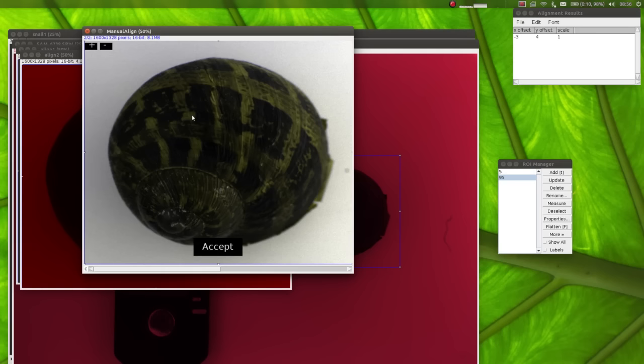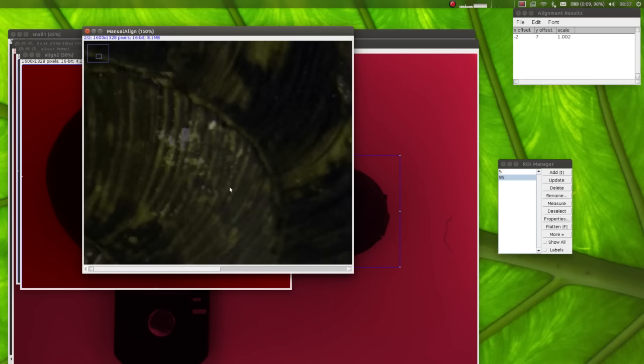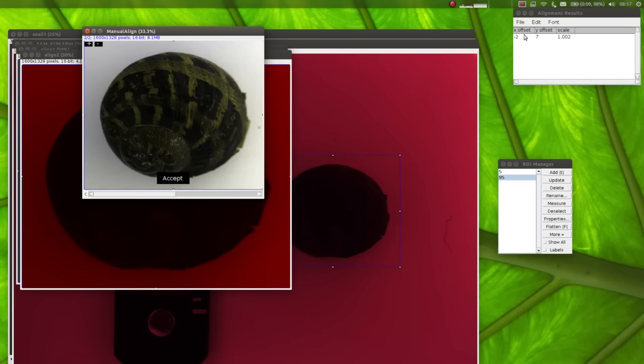Some lenses also will have a bit of chromatic distortion between the visible and UV, and that will cause one of the images to be slightly bigger than the other. In order to control for that, you can use the plus and minus buttons here. So for example, if I press minus a few times, it makes the yellow channel here smaller than the blue channel. This value looks okay. The values of your offset are shown at the top right here. When you're happy with the alignment, just press accept.